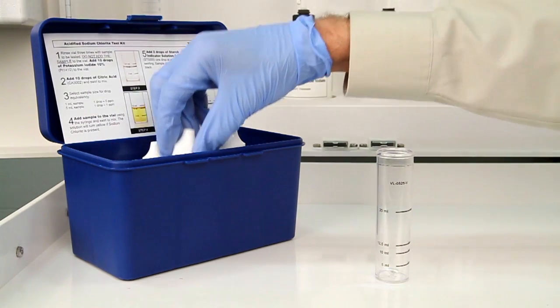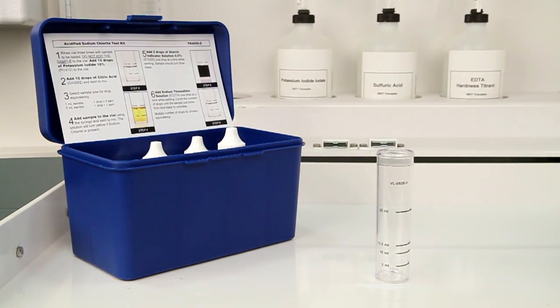Next, add 10 drops of citric acid. Hold the bottle vertically to get a consistent drop size.